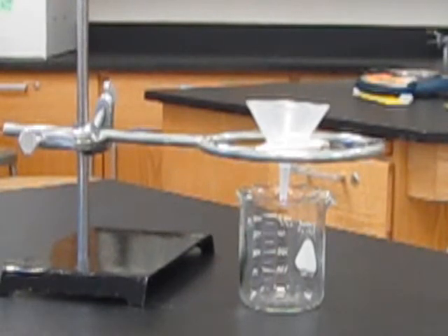Right next to step number 12, please draw a sketch of what this looks like. Again, ring stand with a ring, clay triangle, funnel through the clay triangle, and a beaker at the bottom. Pause this video if you need to take a second to do so.